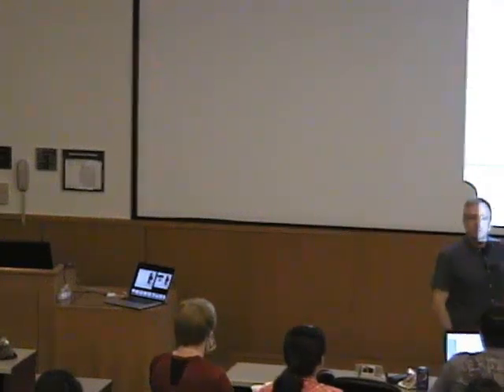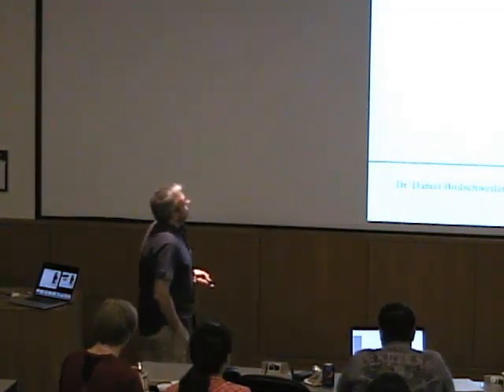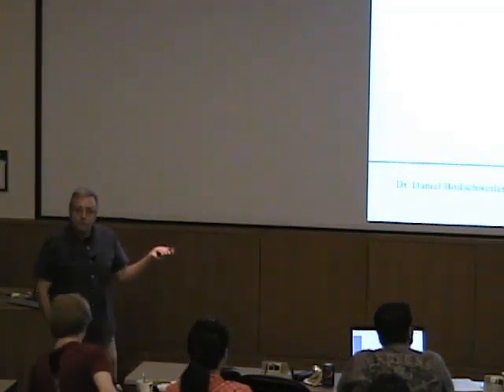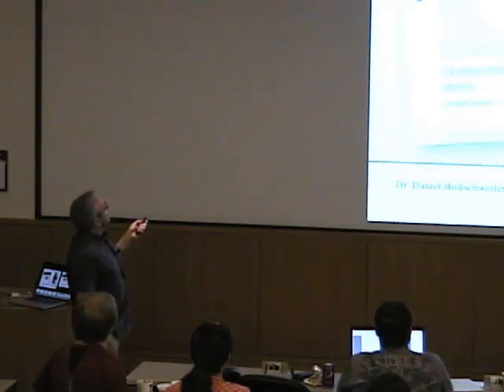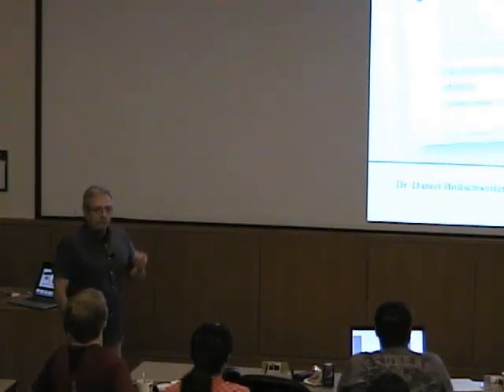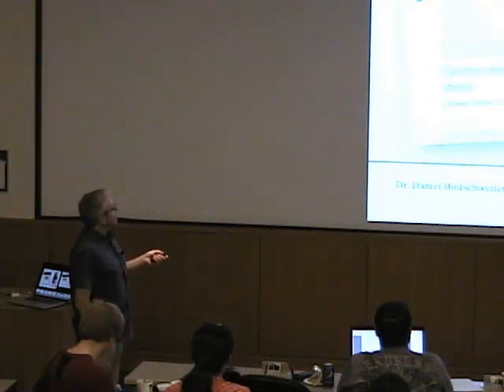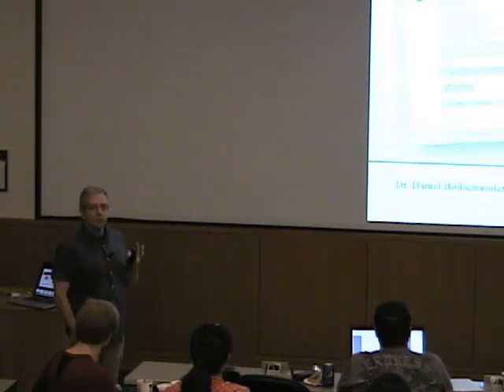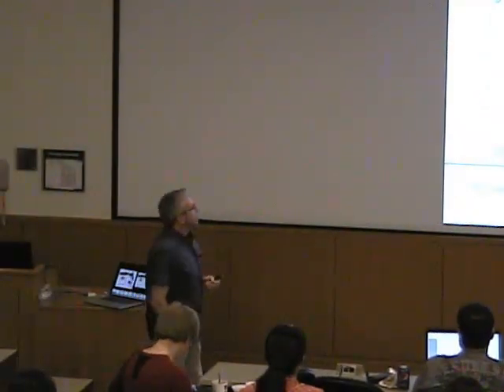It's the same I showed you before, just with a fancy case around. That's what people learn from Apple, I guess. And this is what everybody uses really nowadays to get all these things that you have. And then, of course, the appropriate magazines go for it and will give you editorials and headlines, in the idea that science is still very held back, saying electron microscopes close to imaging individual atoms.